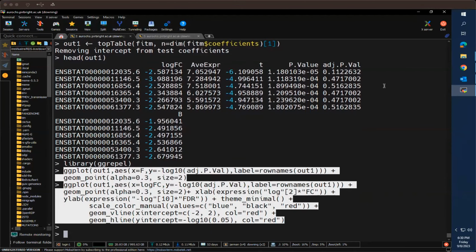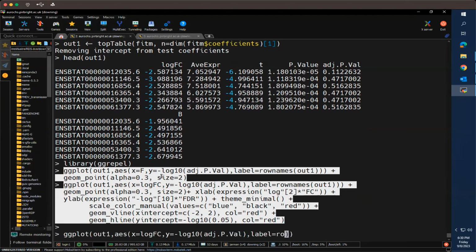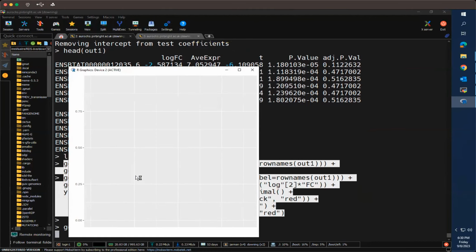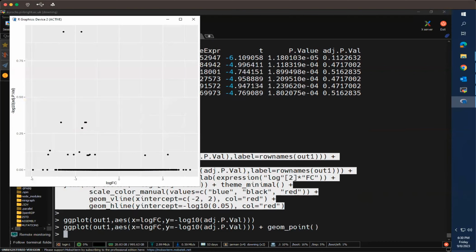Sorry, that's not very visible. Let's start with that only, because we're going to add labels here later for ggrepel. But let's just start with this simple function. So that creates a basic background for a volcano plot. And then we can add geom_point on top of that just to create some points. It's best to build this up very simply first. So we see our points there.